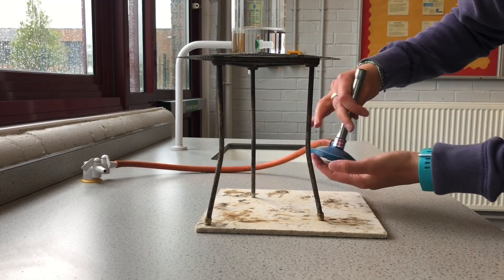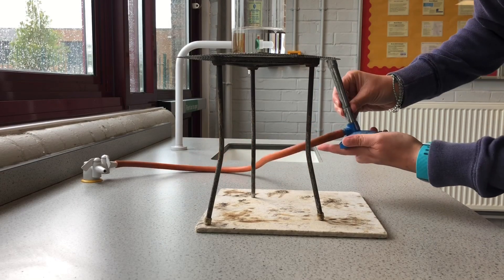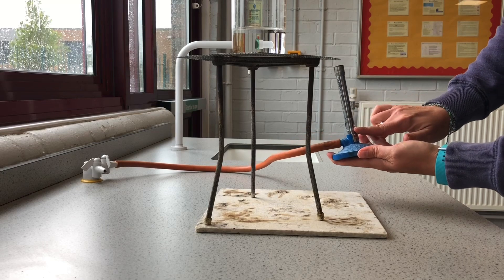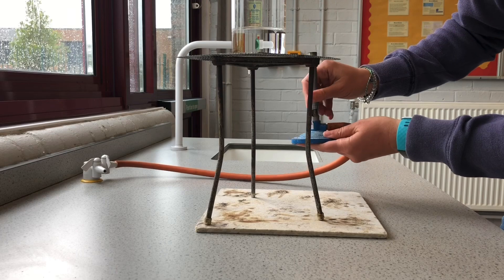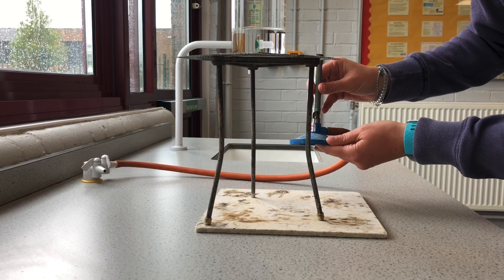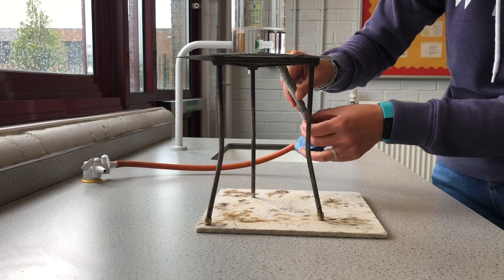And here the air hole is closed. When it's closed it doesn't let as much oxygen in. When it's open, lots of oxygen can get into the flame and it makes it burn more vigorously.